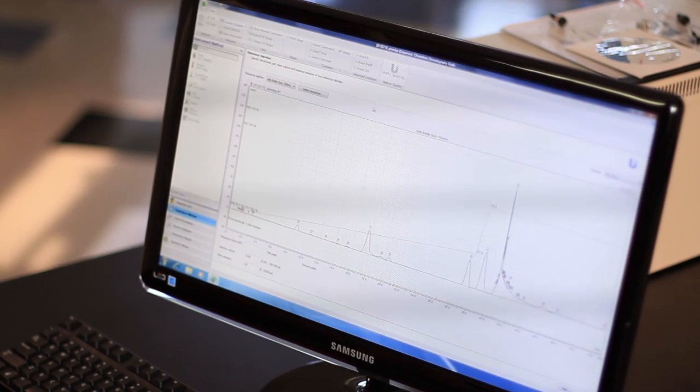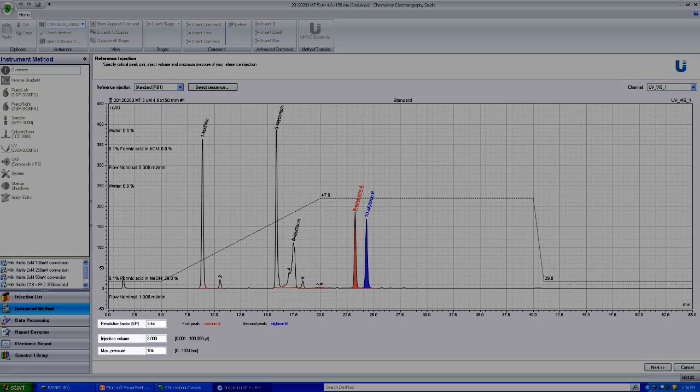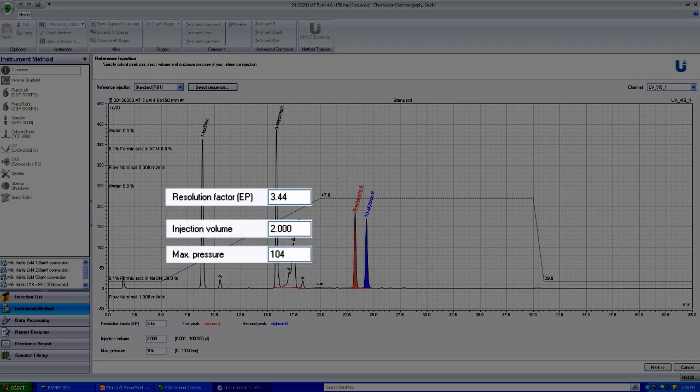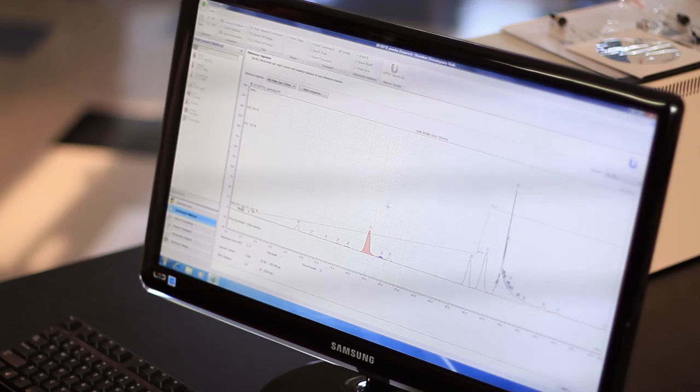What we need to do in the first step is select the critical pair of the two peaks which are most of our concern to be clearly separated. Once we have very graphically and visually assigned that peak pair, we can just move to the next step.